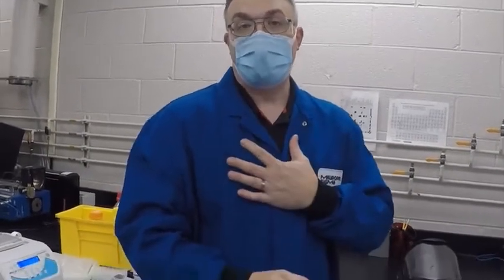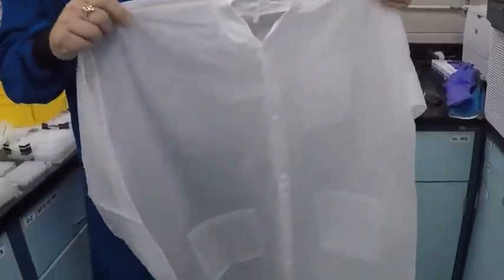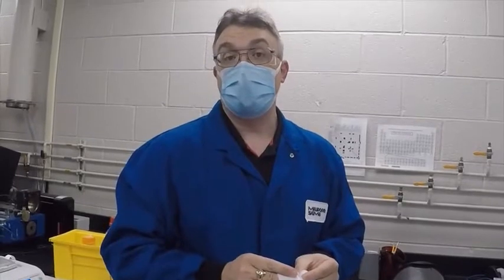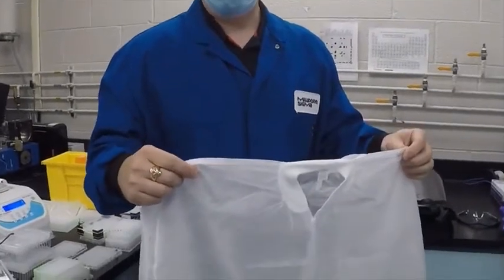There are different styles of lab coats. You can have a launderable lab coat or a disposable lab coat. Disposable lab coats are nice because if they become soiled, they can be disposed of just like your disposable gloves in your waste stream, as your safety manager will direct you, depending on what they're contaminated with.